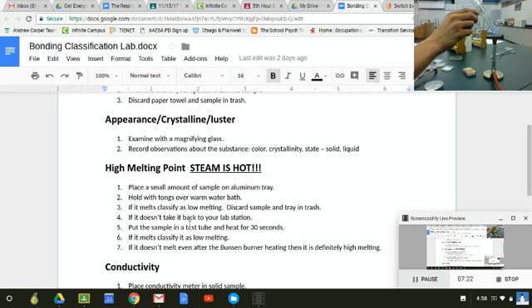16, 17, 18, 19, 20, 21, 22, 23, 24, 25, 26, 27, 28, 29, 30. All right, so now this is very hot. So you need to be careful that when you're done with that, you put that away. Now, when you are done with that, turn off your gas.